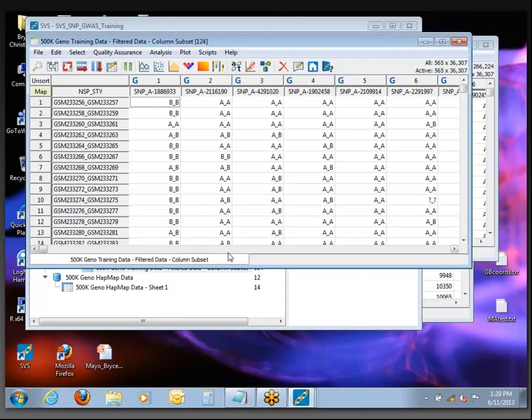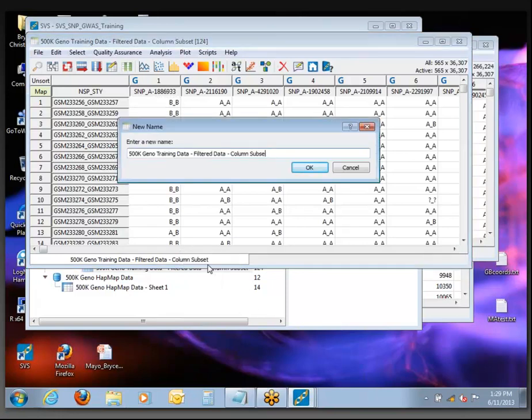I'm going to rename this one more time. The tutorial tells us to call it 'filtered pruned training data', so you can call it whatever you like — I'm just going to call it 'filtered pruned'.